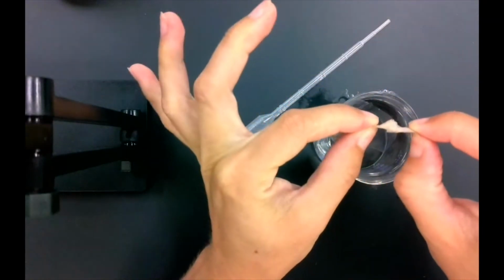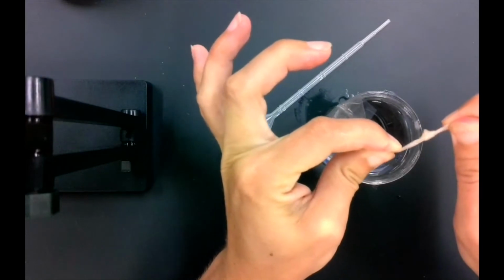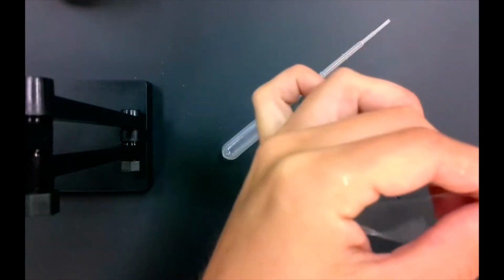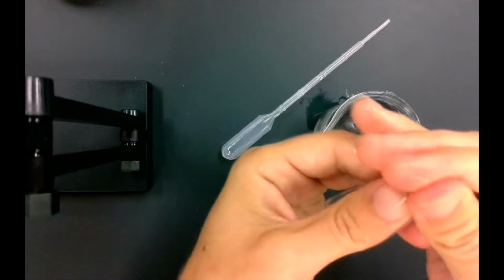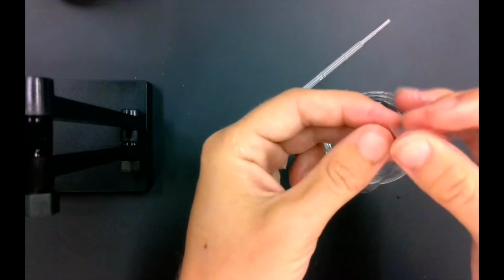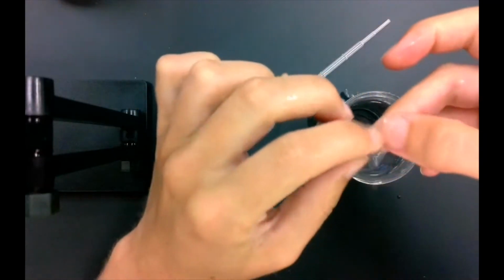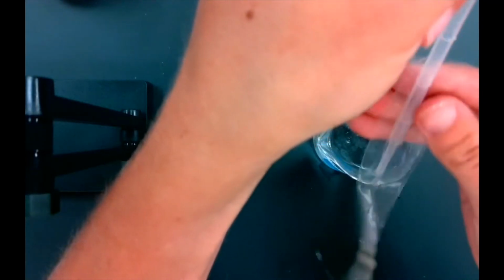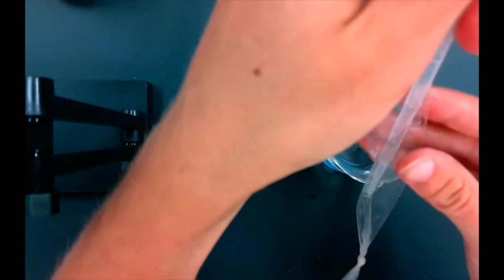Now that I've got that knot, I want to make sure it's nice and tight, so I'll pull it as tight as I can. Great. So basically I have a little sack with one end that is knotted. And what I want to do is open the other end of the dialysis tube. This is tricky, but with enough practice, you can open it. Sometimes I like to use a pipette to put some air into it in order to get that bag open.